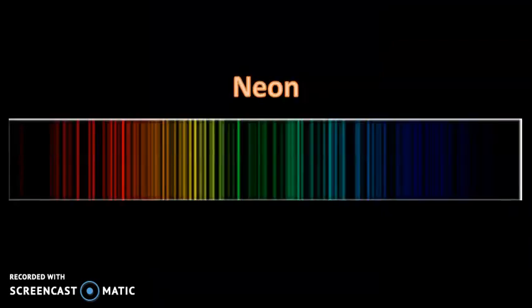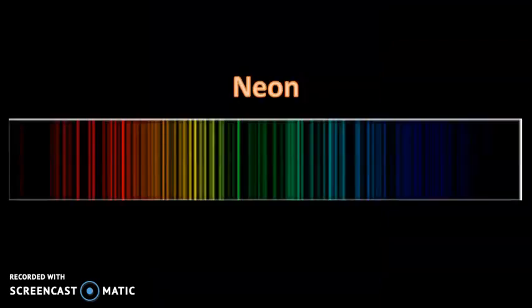And you're going to kind of laugh when you see the official spectrum because you're going to say, oh my gosh, where are all those colors coming from? So here's the actual official spectrum. I'm kind of blown away with how many green and blue tones there are in this one because in the spectra paper version of it, I don't see those at all. And I think it's just because the red and the orange and the yellow are so bright that they're overwhelming the remainder of the spectrum, that we are just not able to see it with our eyes in our lab. But that's the official spectrum of neon.